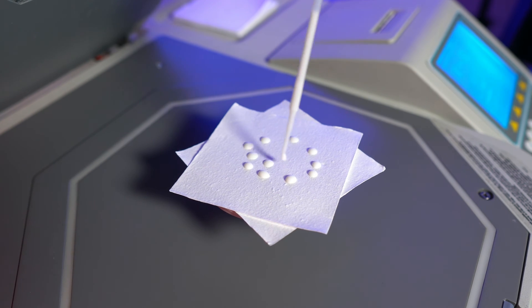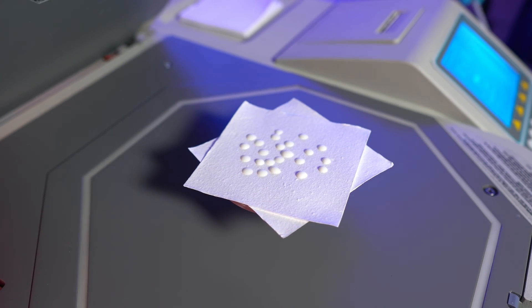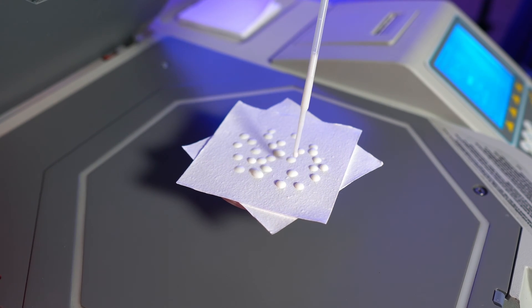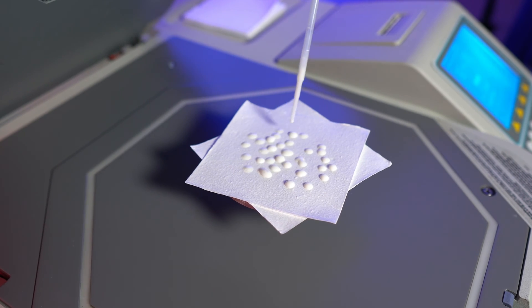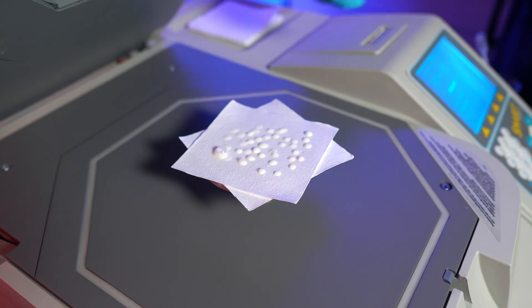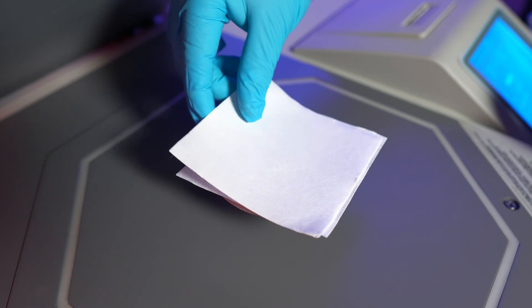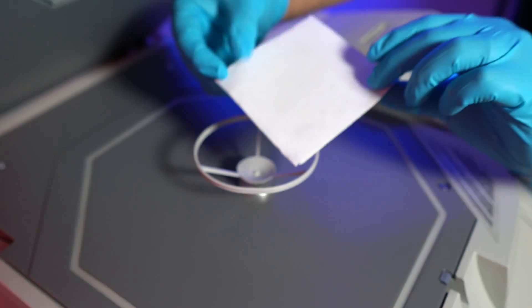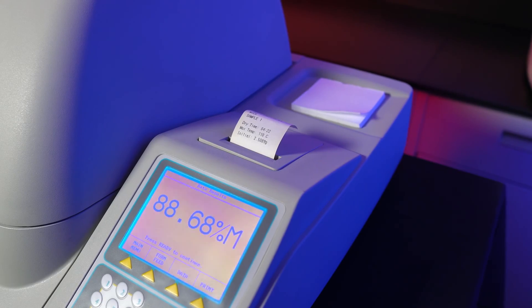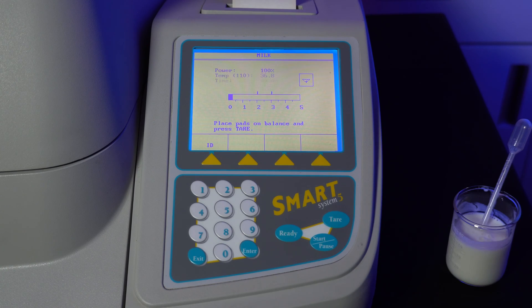We'll now apply between 2 to 3 grams of our sample using the pipette and applying in a swirling motion to maximize the surface area of the sample on the pads, therefore leading to faster drying times and more accurate results since more moisture will be dried. Once the weight of the sample is between 2 and 3 grams, take the bottom sample pad and place it on top of the other pad and sandwich them together. Close the lid, hit start. When the test is done, your results will be printed. Hit ready to continue testing or hit exit to return to the main menu.